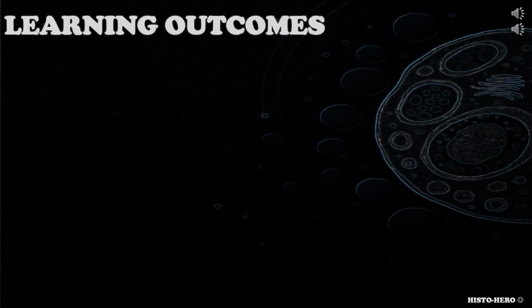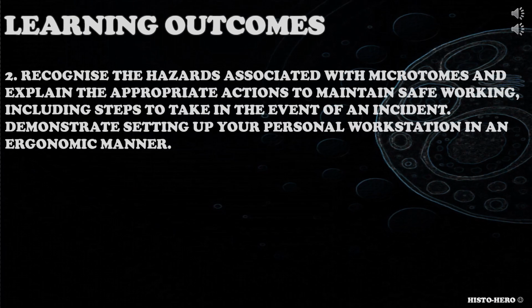The second learning outcome is recognize the hazards associated with microtomes and explain the appropriate actions to maintain safe working, including steps to take in the event of an incident. Demonstrate setting up your personal workstation in an ergonomic manner. Candidate needs to know about hazards associated with microtomy and correct set up of working station.